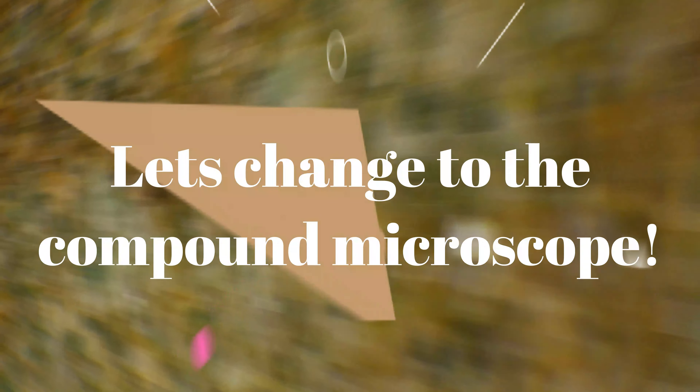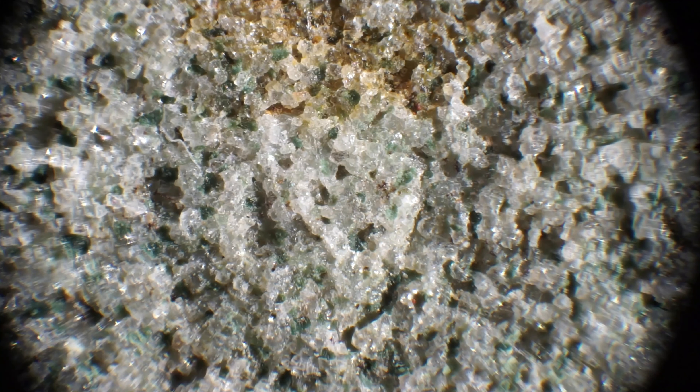We have now reached the maximum zoom of this microscope and we will change to the compound microscope. Here we got a little clearer image quality and I decided to do some focus stacking, just focusing through the whole area. Then I use Helicon Focus 7 to build up the image, and then I add some color and sharpness in GIMP.